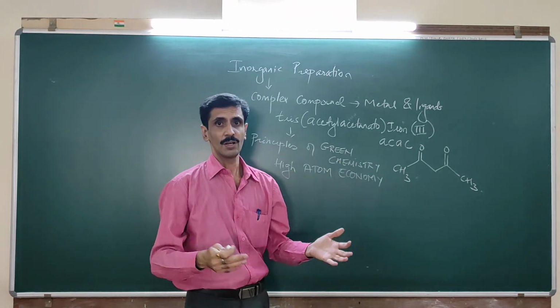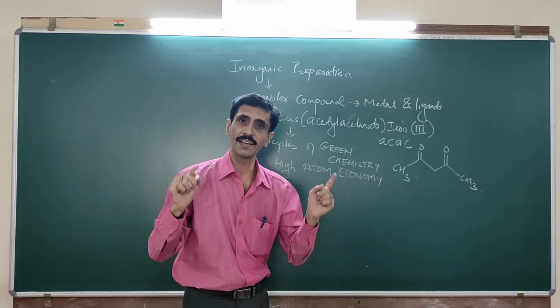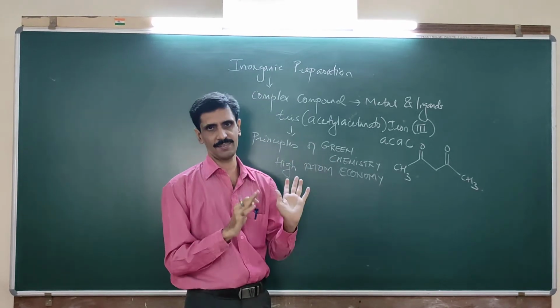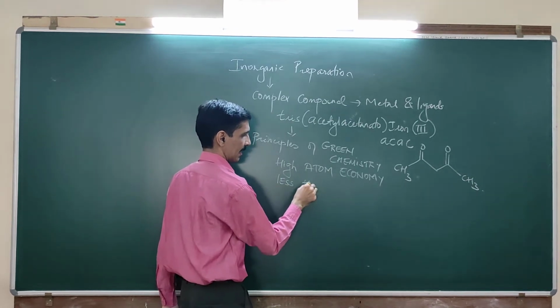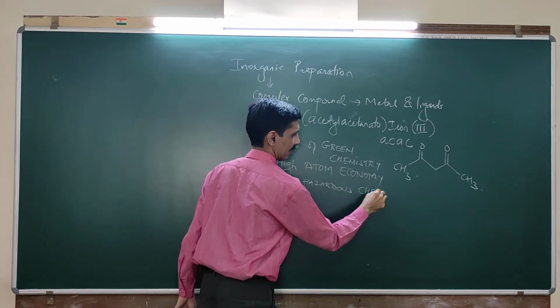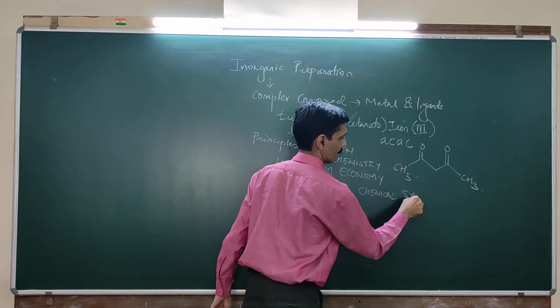Next thing is, in the entire procedure that we are going to follow in the synthesis of this complex, we are going to use less hazardous chemicals. Okay, so that is number two: less hazardous, less dangerous chemical synthesis is followed in this particular case.